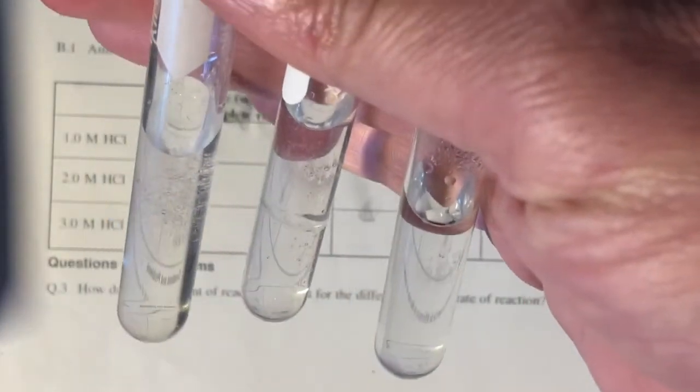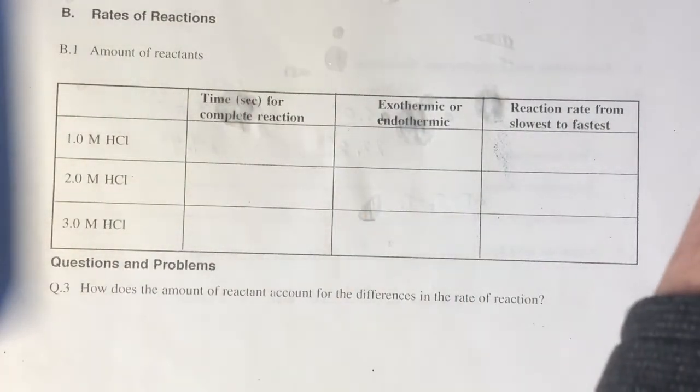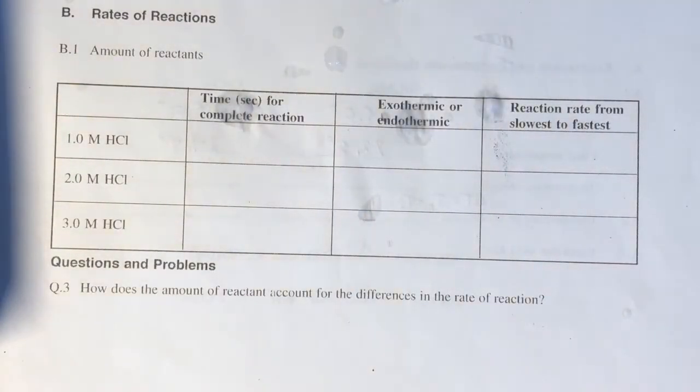And 1 molar is done. All right, so note those times. Washes the hydrochloric acid off.